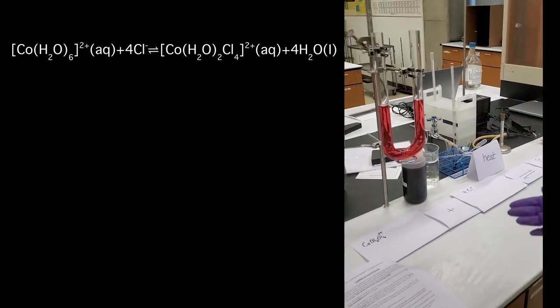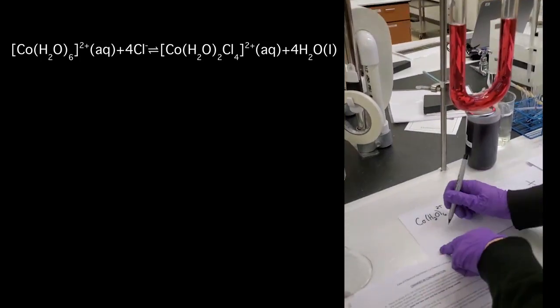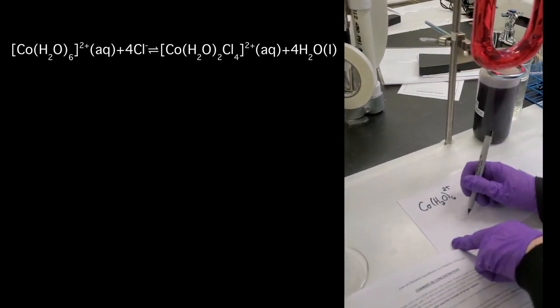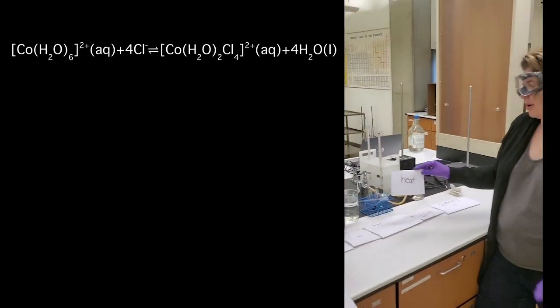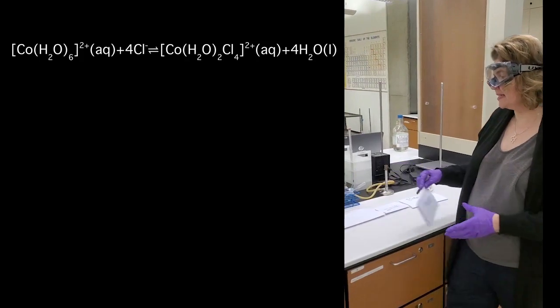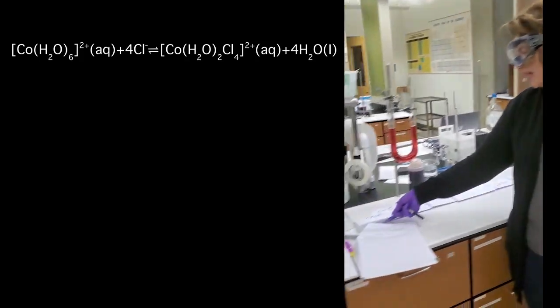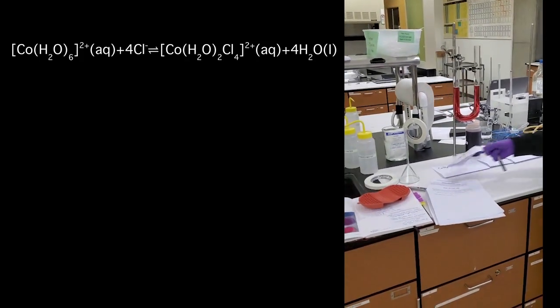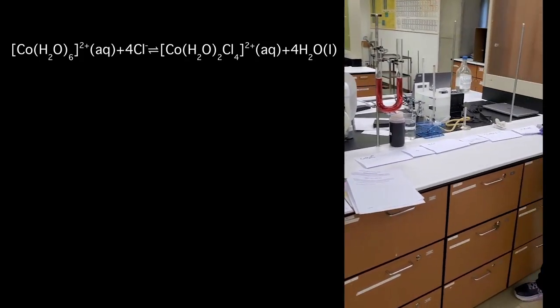This one's red — that one's red. Now I'm going to play with the temperature, because all reactions are either endothermic or exothermic, and I've got to figure out which one this is. If it's endothermic, we're going to treat heat as a reactant. If it's exothermic, heat as a product.